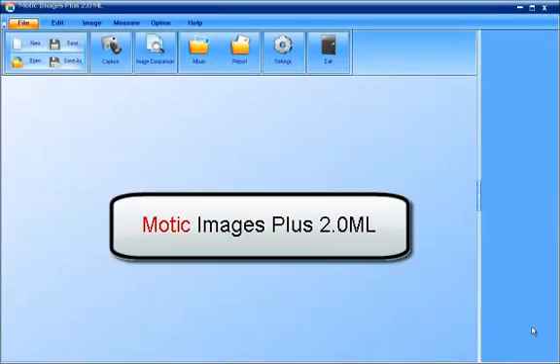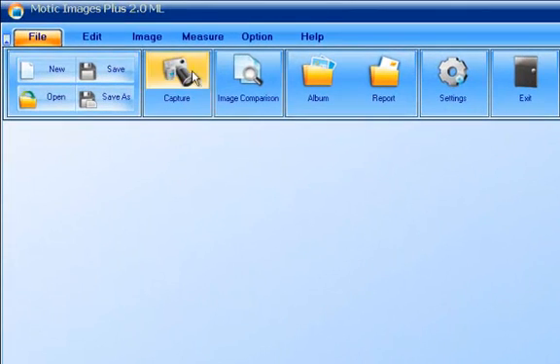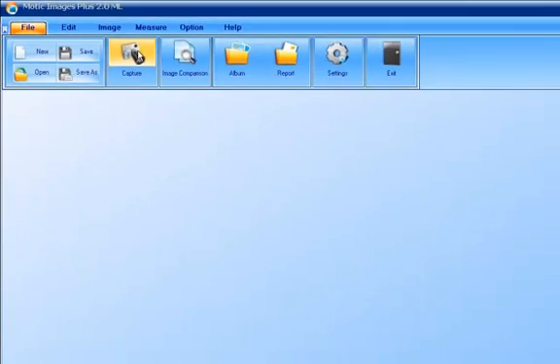After you've opened MOTIC Images Plus 2.0, look for the capture button and press it to open the live camera view.